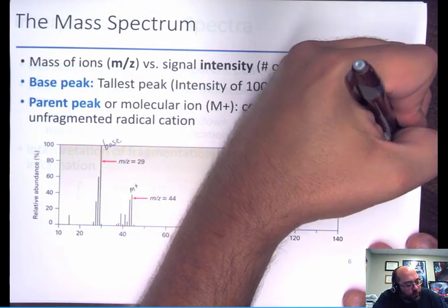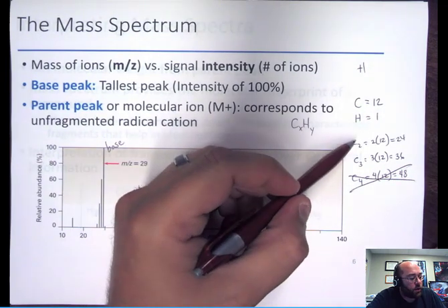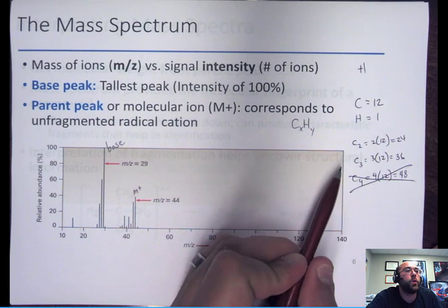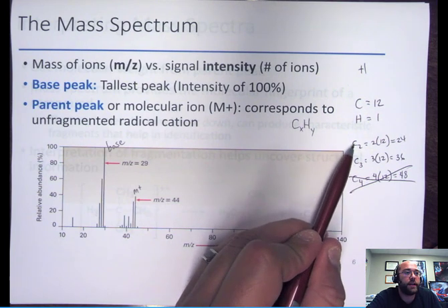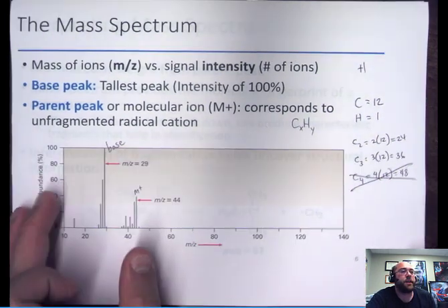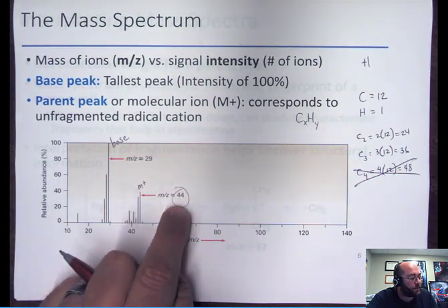That equals 24. So the way I do this when I'm trying to estimate is I look at the number of carbons until I get a failure, like I did here. I did C3 first, and that one passed, but the next bigger one failed. So let me go down 1. Instead of C3, I did C2 to see the mass there. So I have 2 options here: I either have C2 or C3. Well, my total mass has to be 44.